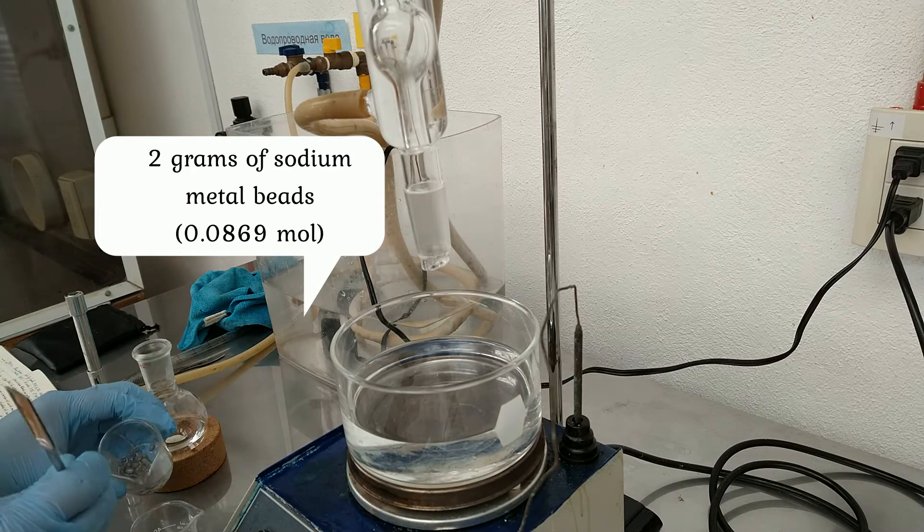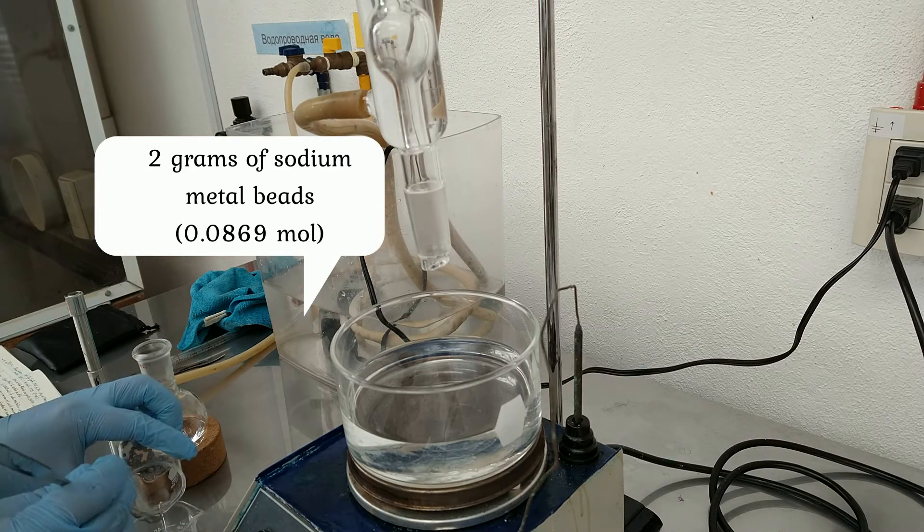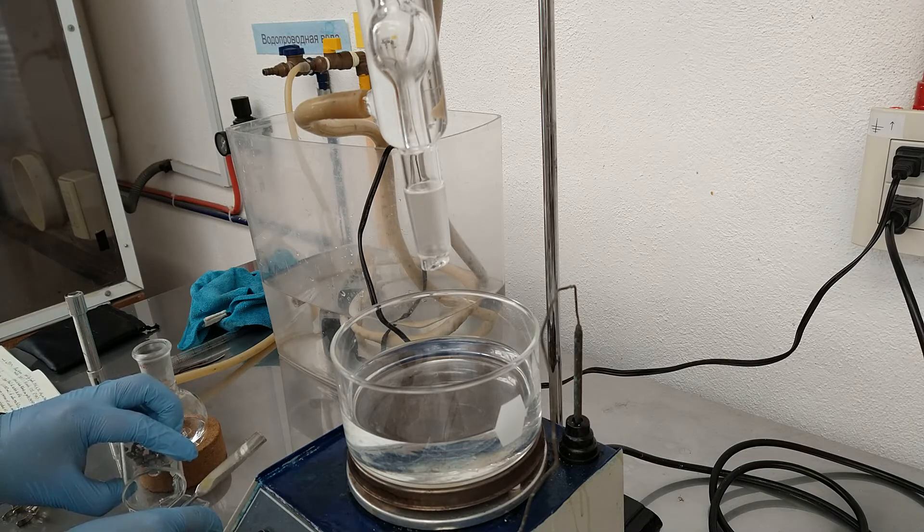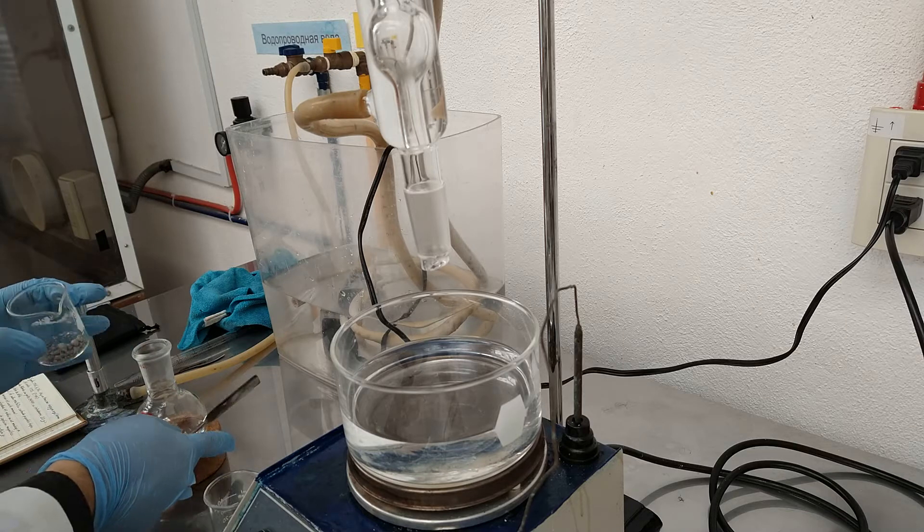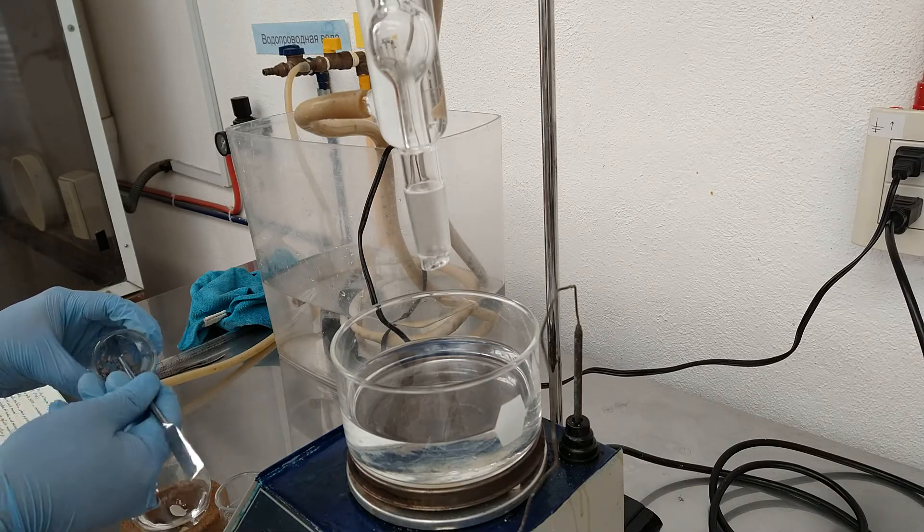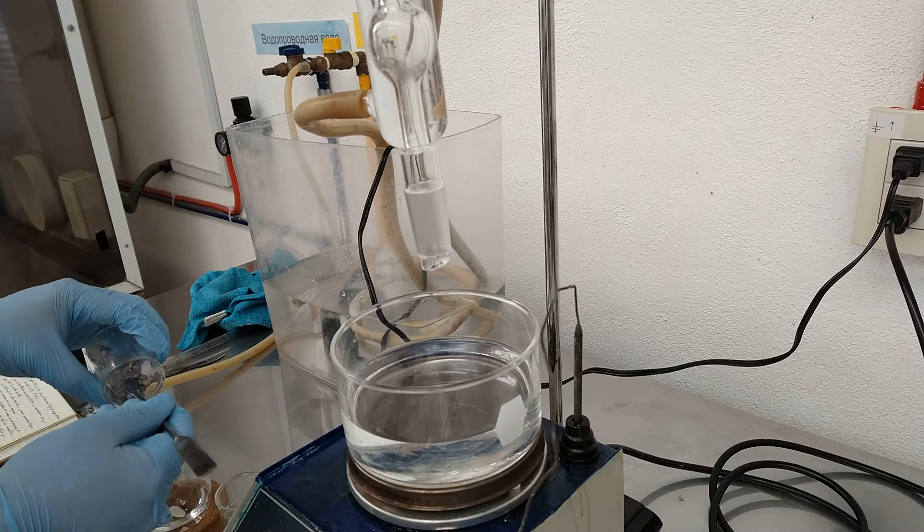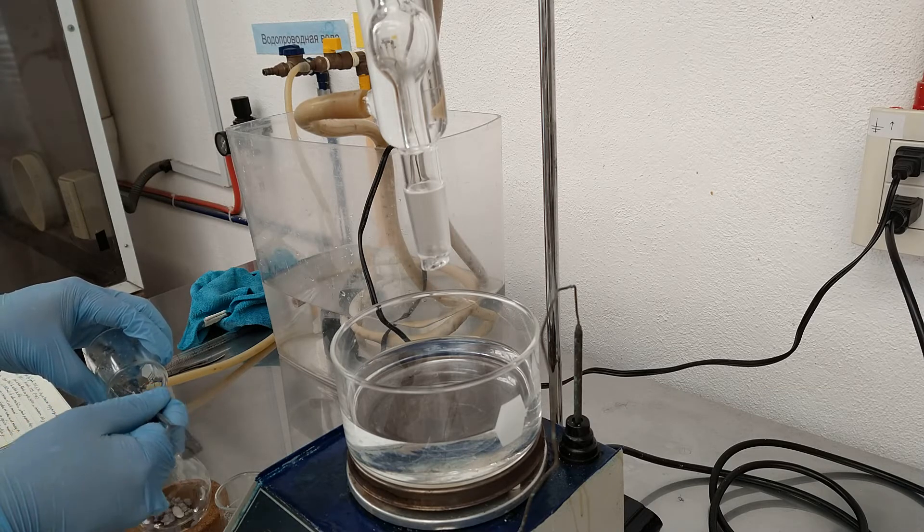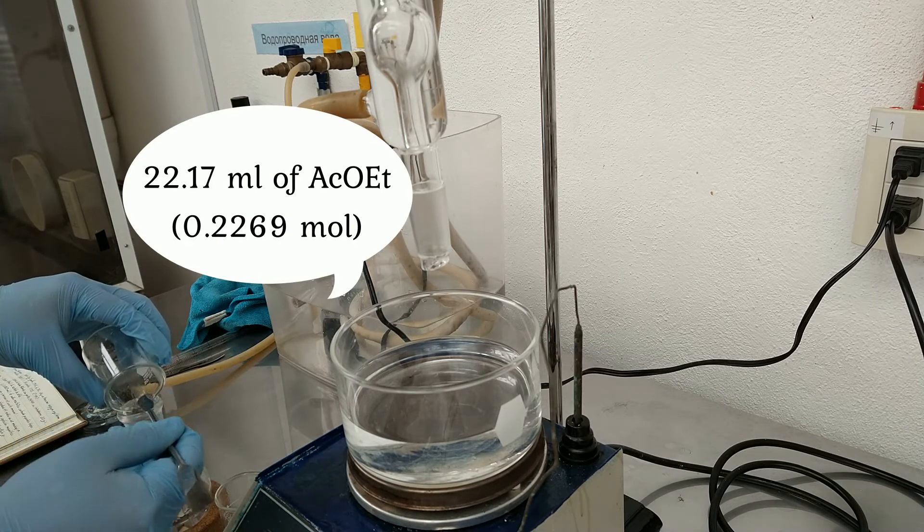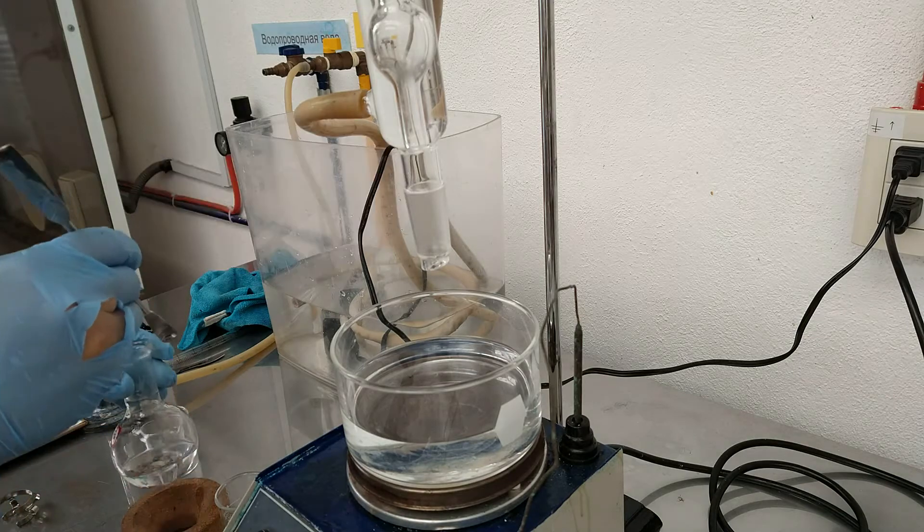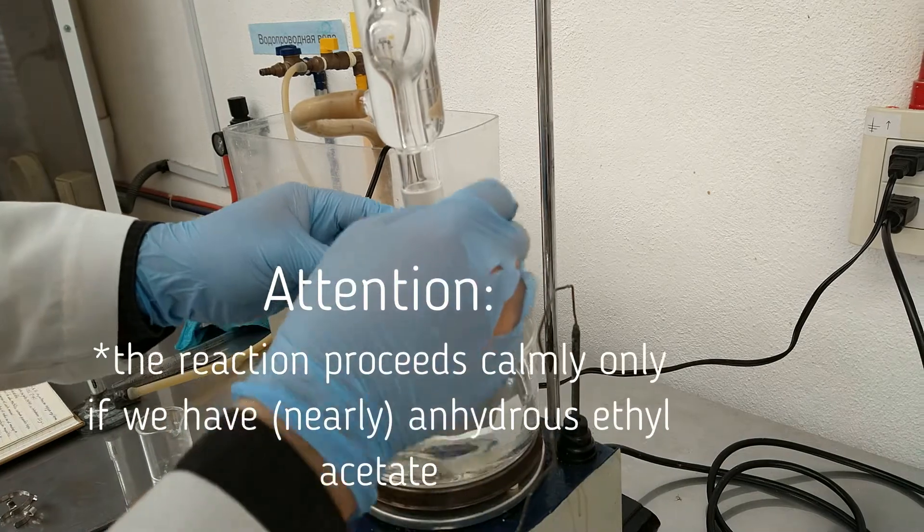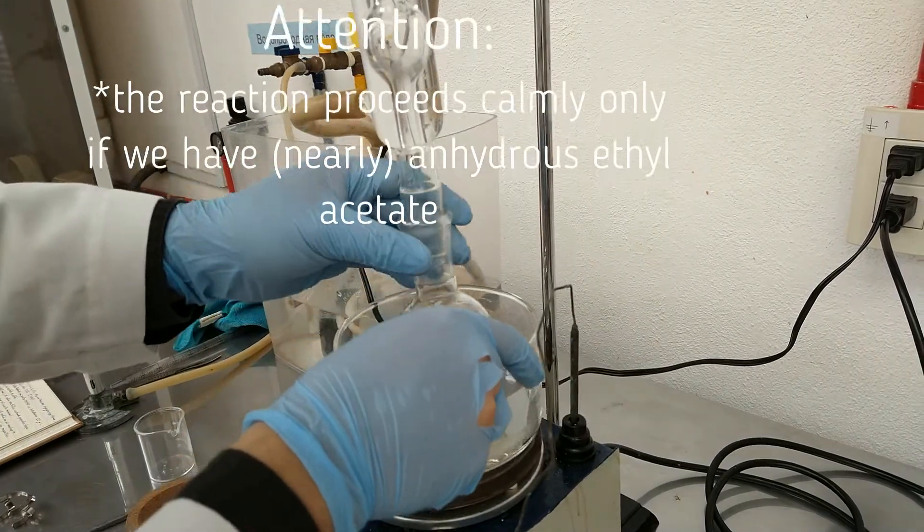Now we have here our sodium metal beads in some hexanes to remove the excess mineral oil. We have 2 grams of sodium beads and then we have to add them very quickly to our 22.17 milliliters of ethyl acetate. We don't have to worry about immediate reaction. As soon as this is done with the stirring bar inside the flask, we can now adapt it to the condenser.